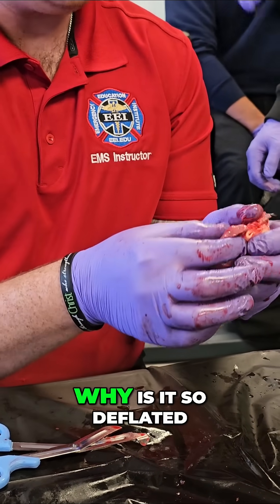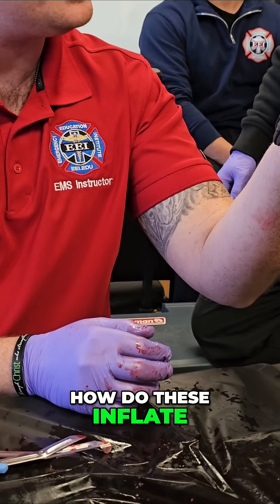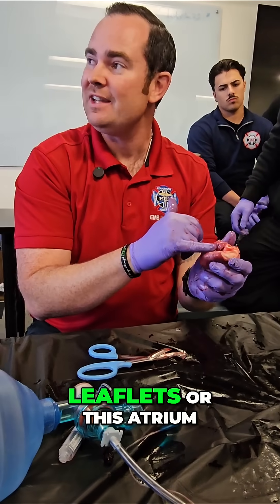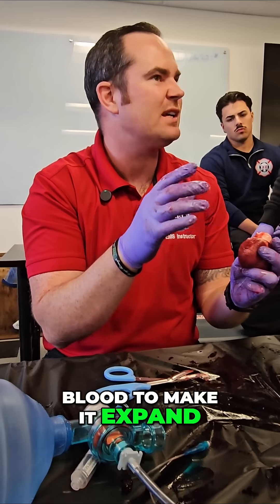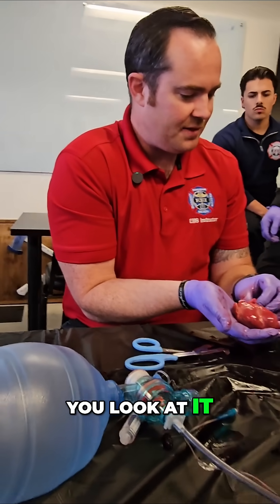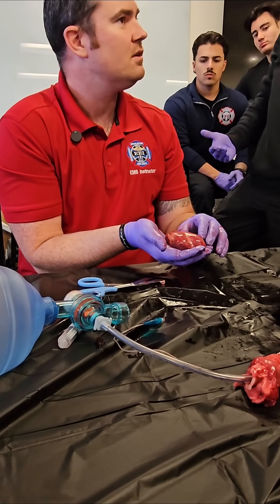So why is it so deflated? And how do these inflate? Well, blood pressure has to actually go into these leaflets or these atrium to fill up with blood to make it expand. But when you cut out a heart and look at it, this is the atrium right here. All of this is all ventricle. Crazy, huh?